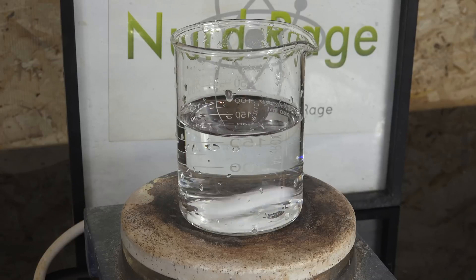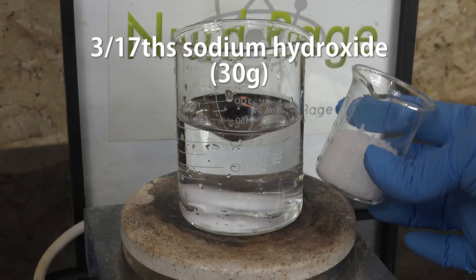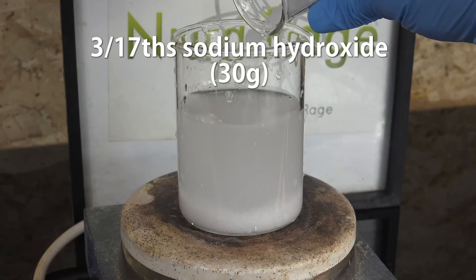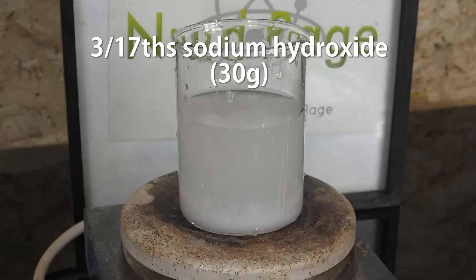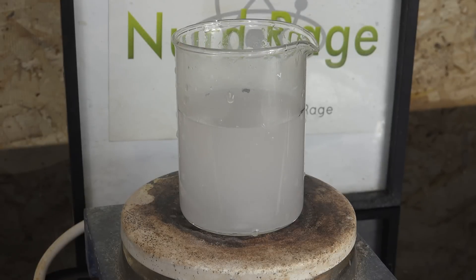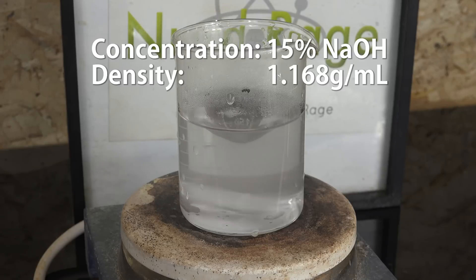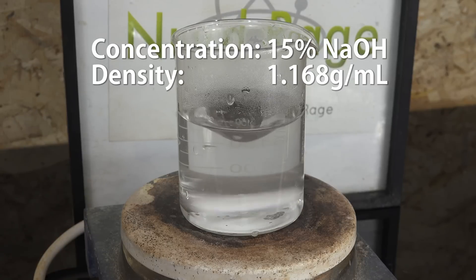To the water we add 3/17ths by mass of sodium hydroxide — so for 170 g of water we add 30 g of sodium hydroxide — and stir until dissolved. That odd fraction produces a solution that is 15% sodium hydroxide by mass, which at room temperature has a density of about 1.168 g/mL. I'm using sodium hydroxide because it's very easy to make solutions in the density range we need, and this density will separate the two types of resin.